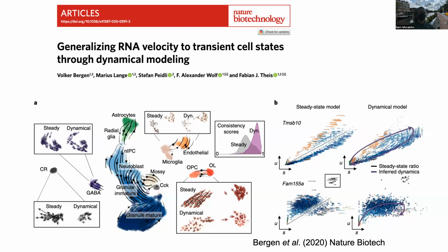You can also think about it like, if you stimulate a cell with a drug or something, it'll probably change in response. So you can use pseudotime to model the change, but that's not necessarily development. And then it might have an activated and a relaxed state, so it could go back and oscillate.